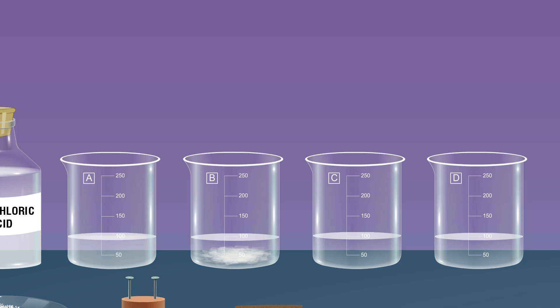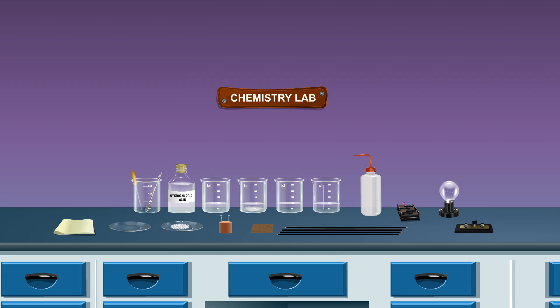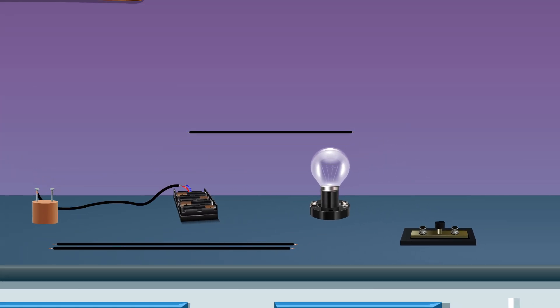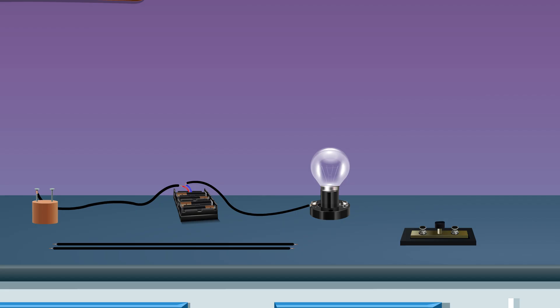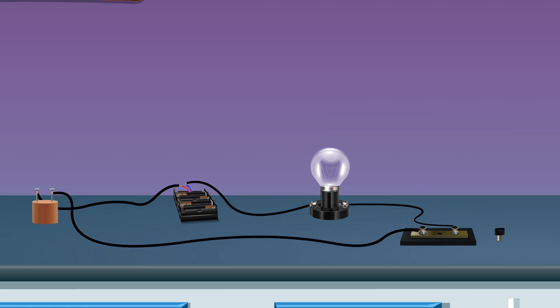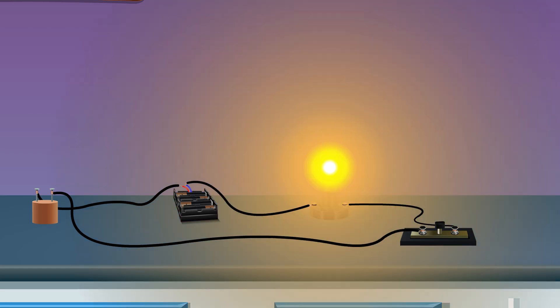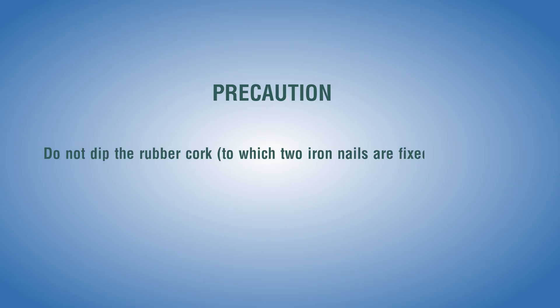Do not add anything to the distilled water in beaker D. Set up the electric circuit by connecting different components with the help of connecting wires. Insert the key into the plug and test the circuit — if the circuit is right, the bulb glows; if the circuit is wrong, the bulb does not glow.